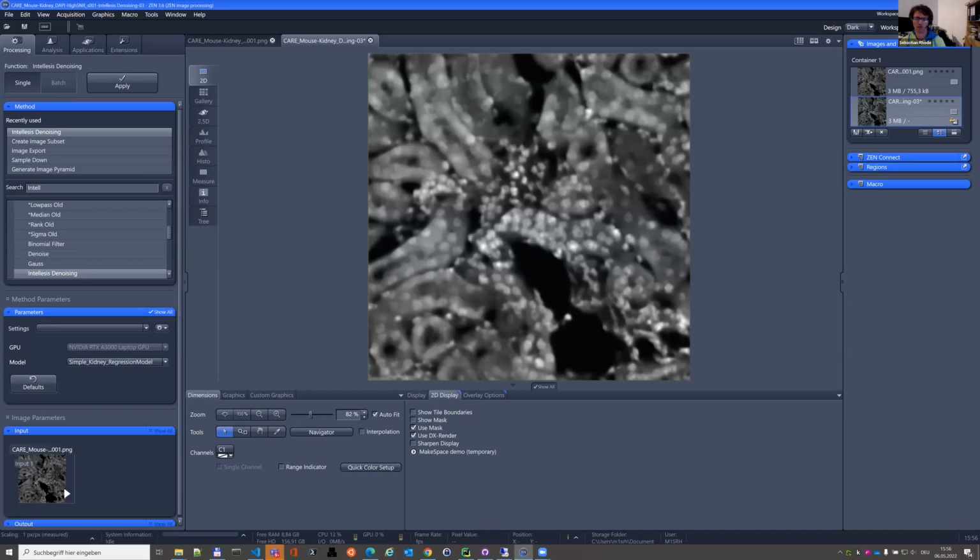This allows you to package your own models easily, including metadata and unique identifiers, and use it in our ZEN software. But it also works in a way that you can download the models and use them, for instance, as I showed you, in Napari to segment images. So it's really by no means limited to our own software solutions.